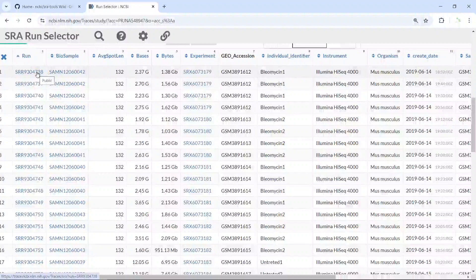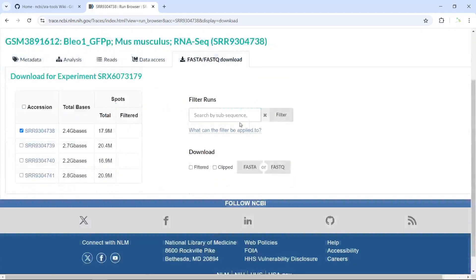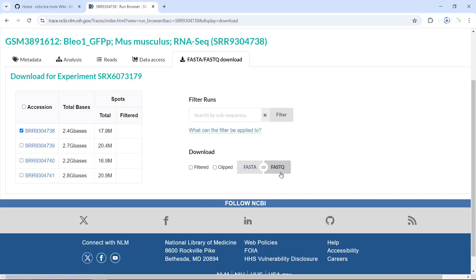Let's try to download the first one by clicking the link. You can see you have a link to download the FastQ or FastA files. We selected the first one — the total bases are 2.4G. If you want FastA files, click the FastA link. If you want to download the FastQ file, click the FastQ link. You can see the computer starts to download this raw sequencing data as FastQ files.